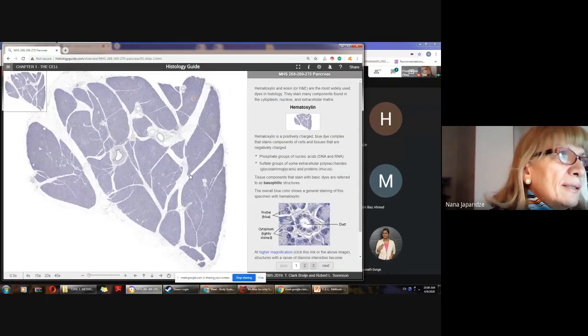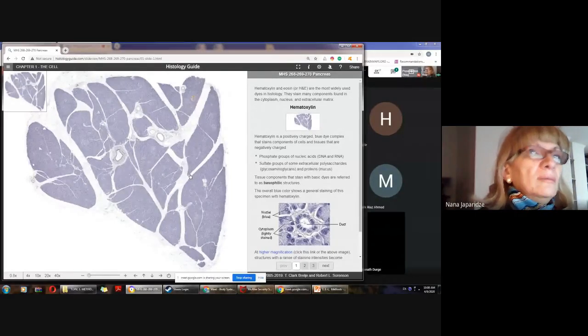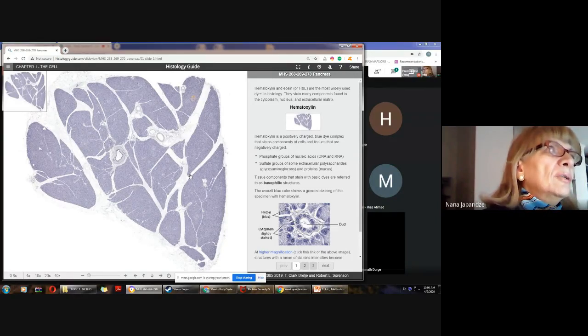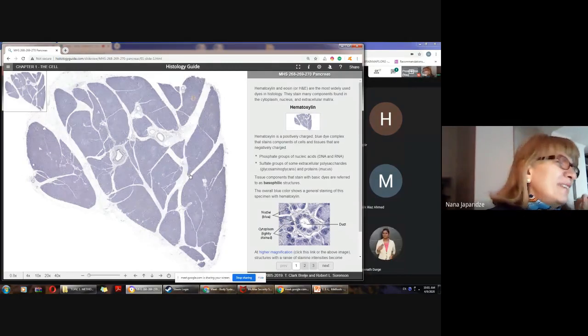Very important, beside the magnification, is a parameter of microscopical technique that I mentioned during my first lecture: resolution power. Resolution power is a very powerful tool with which we are able to identify the finest details of the cell, even those with sizes of several nanometers.